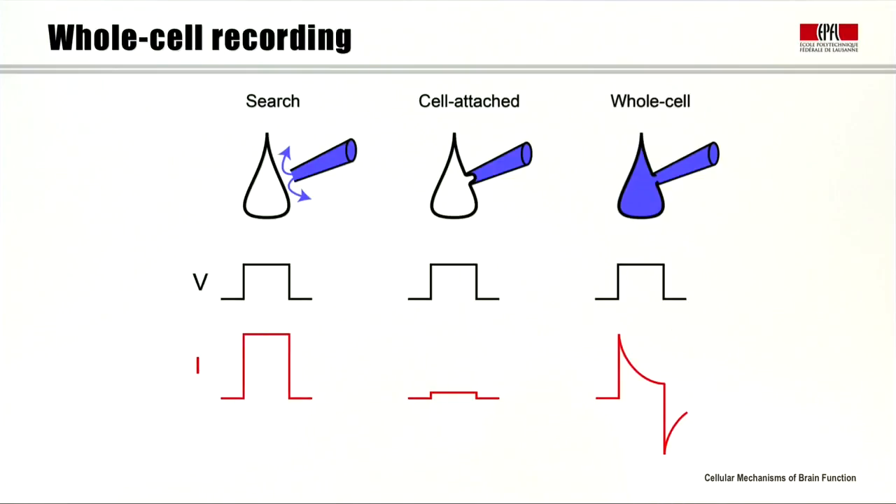In order to have a better understanding of the whole cell recording process, we can first look at these schematic examples. Before putting our pipette into the bath and the tissue, we apply a positive pressure in our pipette so the intracellular solution, shown as blue, can flow out and the tip stays clean. We apply a test voltage and observe the current flow through the pipette. When we touch the cell, we remove the pressure and suck gently. The membrane attaches to the pipette tip and forms a tight electrical seal. Only a very small amount of current passes through the pipette tip — this is the cell-attached patch clamp configuration. Then we do further brief suction pulses to break the membrane in order to establish the whole cell patch clamp configuration.